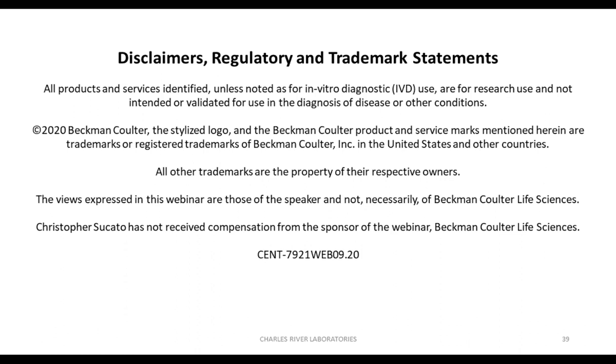Thank you, Dr. Sucato. So we have two related questions coming up, and they are both on the analysis side of things. So the first of these questions is as follows. If a new commercial software was to be developed for the analysis of AUC data, especially focused upon gene therapy samples, then what kind of computing modes or models would you like to see implemented in such a software?